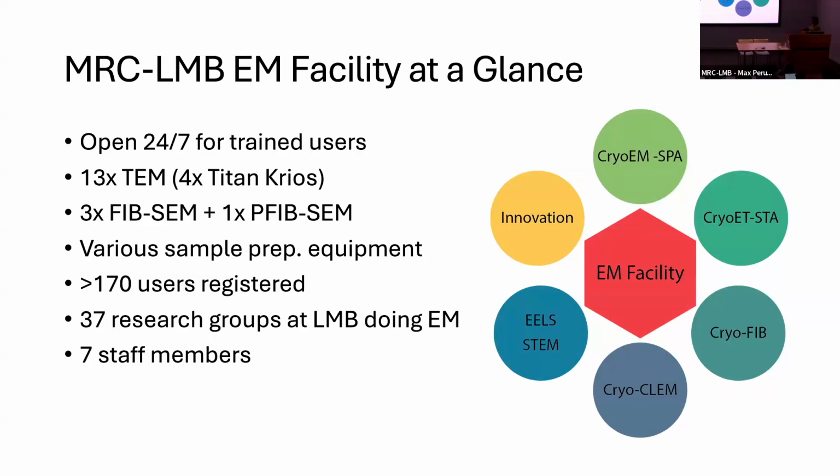We have 4 FIBs in total, including the latest plasma FIB Arctis. We also have access to the Hydra, another one that Rouse's group has. So in total 17 microscopes, with a lot of equipment for preparing samples.